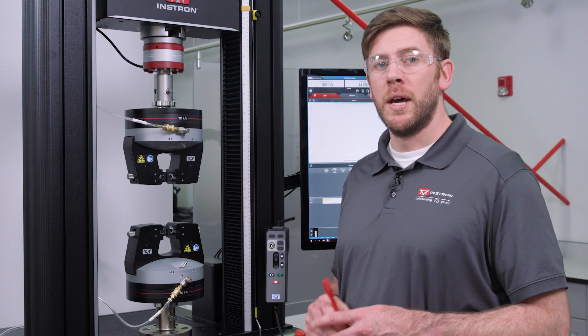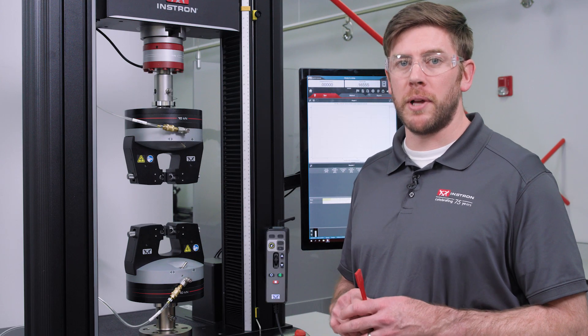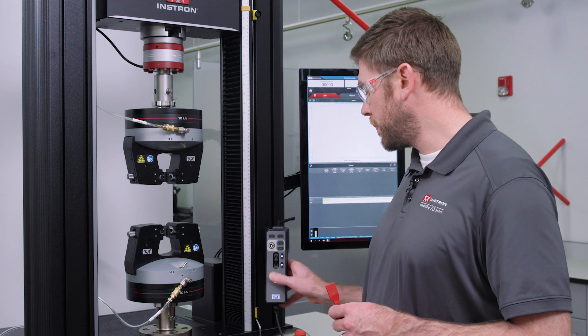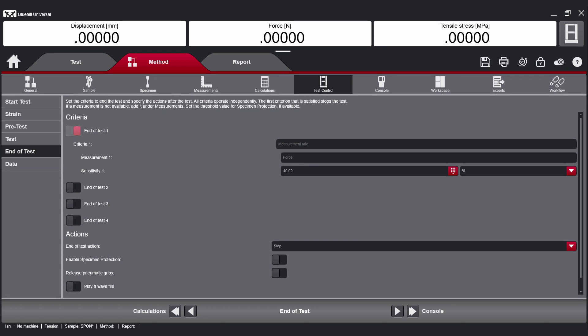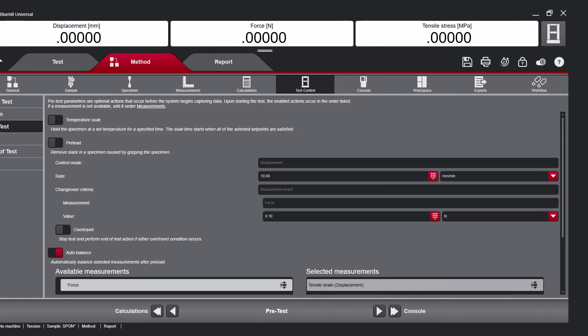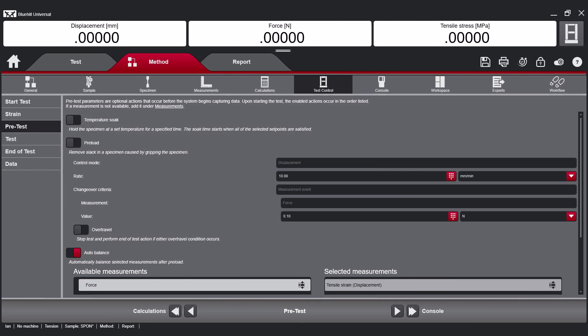Going back to loading the specimen, I do want to mention that in order to properly apply Specimen Protect, you'll want to enable it prior to loading a specimen. Bluehill can be configured to automatically enable Specimen Protect at the end of each test, simplifying your workflow and adding consistency between operators. It's also best practice to use Specimen Protect in conjunction with a preload to ensure consistent results.